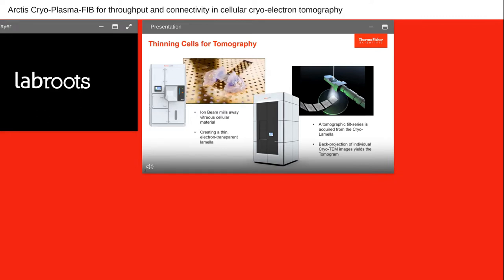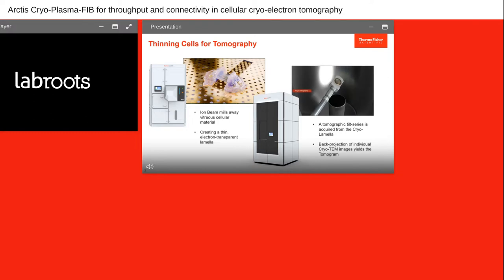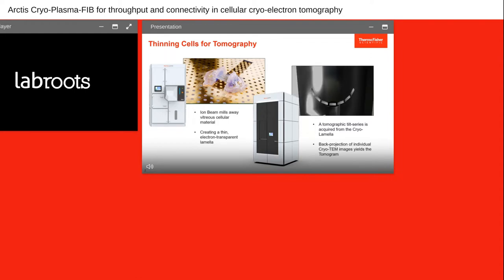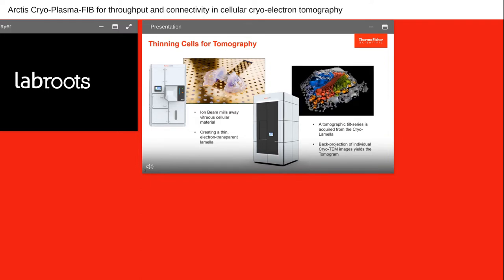Once the cell is prepared, we transfer the lamella into the transmission electron microscope — the Krios — where we acquire the tomogram. We do not rotate the electron source around the sample; instead we tilt the sample under the electron beam and acquire a tomographic tilt series — many different images of the sample at different tilt angles. From this tilt series we back-project into a tomogram and create the tomographic image. The advantage of such a tomogram is that it provides not only structural details of individual proteins but also contextual information about proteins residing within the cellular context.